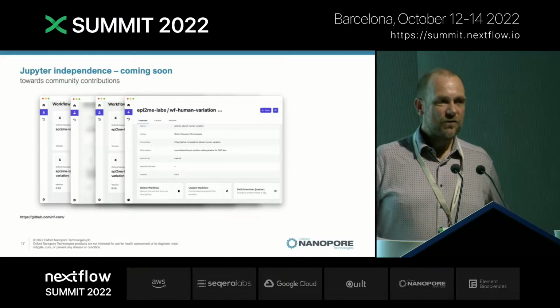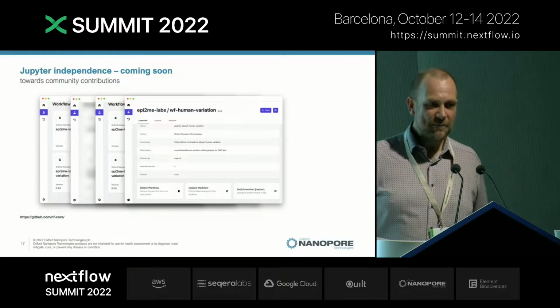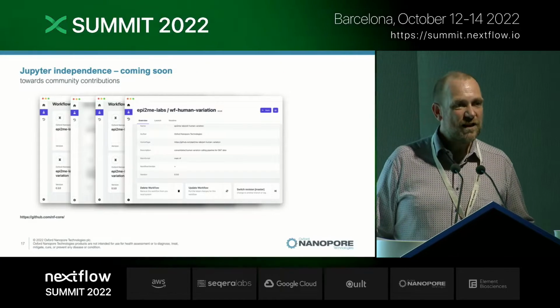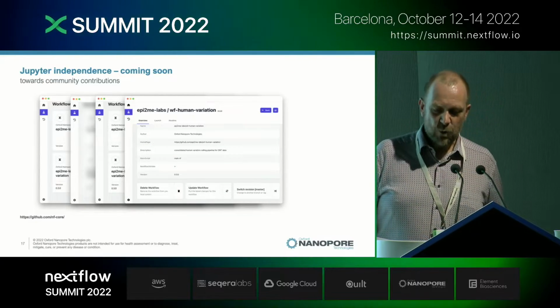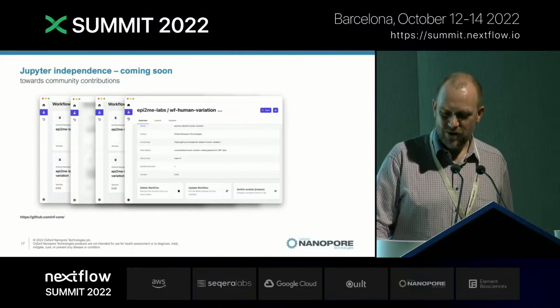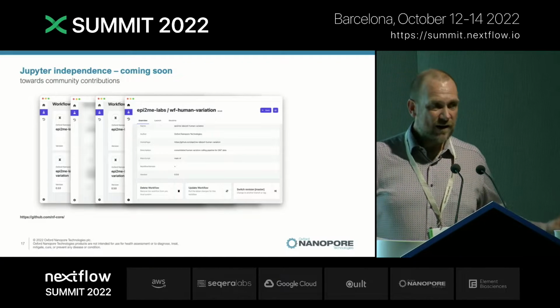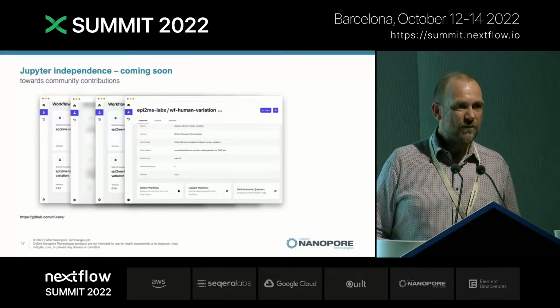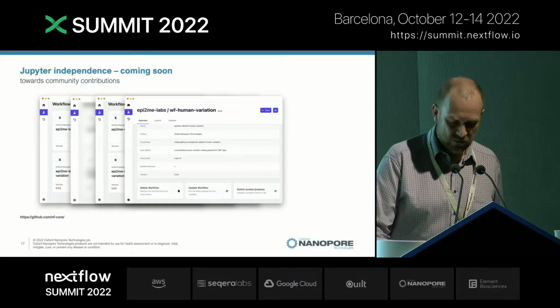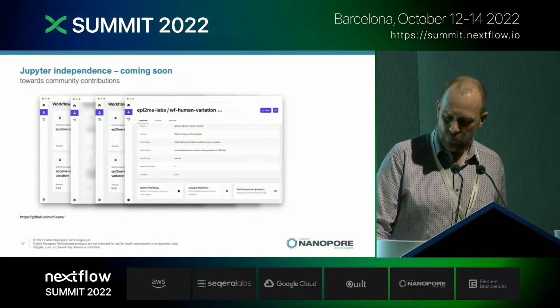Well, we can open a screen. We can update our repository. We can delete our repository. I certainly can't run a human genome analysis on this laptop, but we can certainly have a look at a couple of simpler examples a little bit later on if you are interested. So please watch this space. We have a good idea as to a product that will hopefully be a little bit more applicable to other Nanopore users, and hopefully perhaps generate a little bit of development within the community.